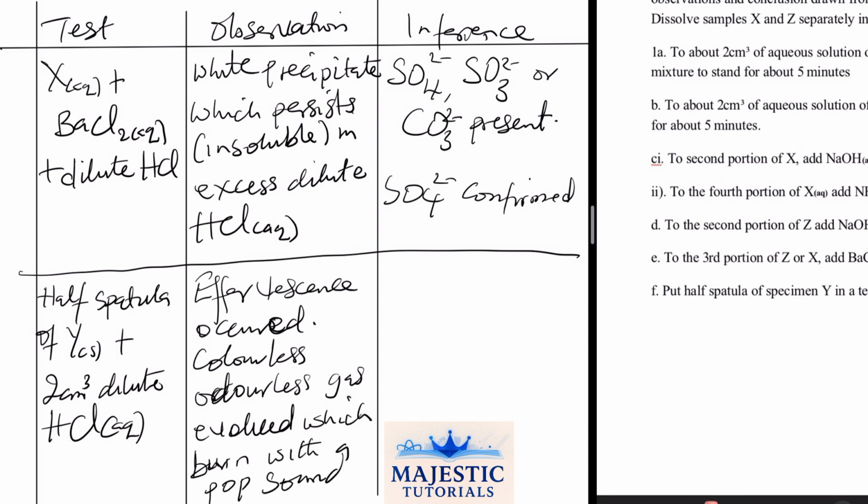You simply say hydrogen gas displaced from the acid. Hydrogen gas displaced from the HCl. You say X is, or Y rather, please, not X.